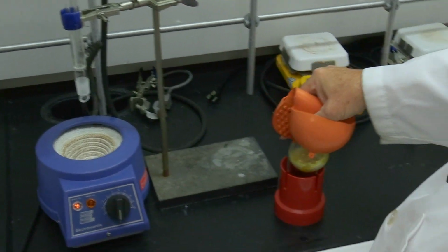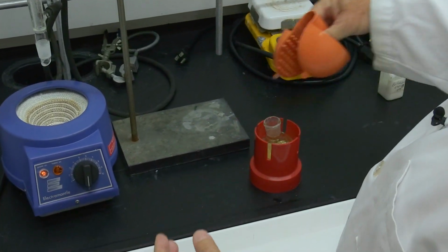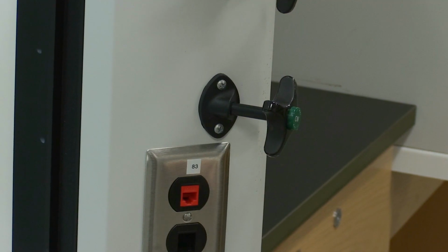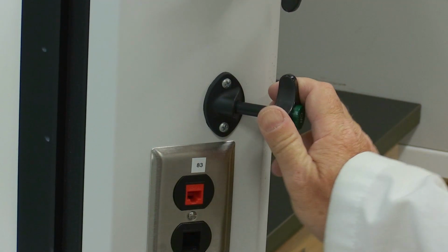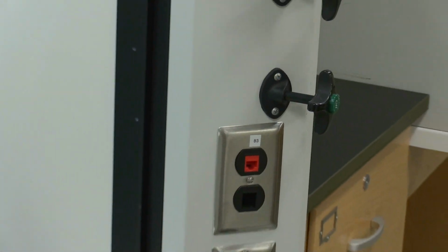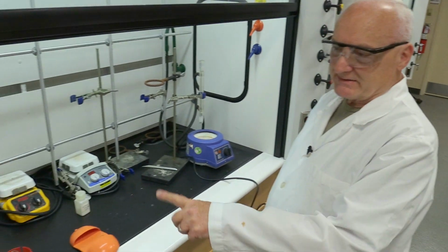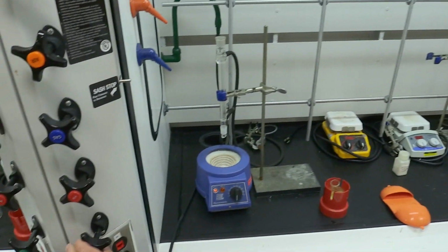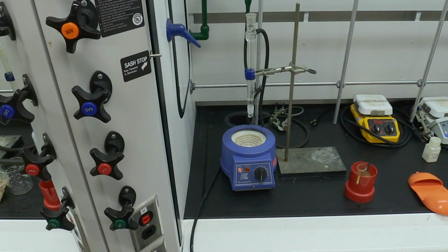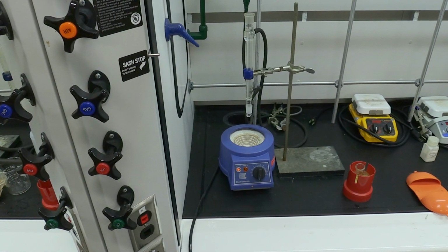We'll let it cool for a few minutes. The last step in the process is just to cut the water flow to the condenser for part B and cut the water flow to the condenser in part A, since we removed the distillation flask from the heat source.